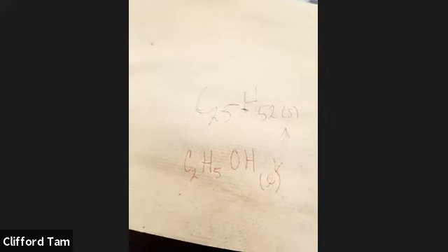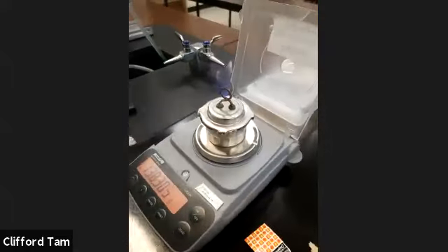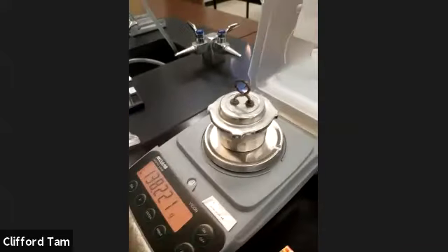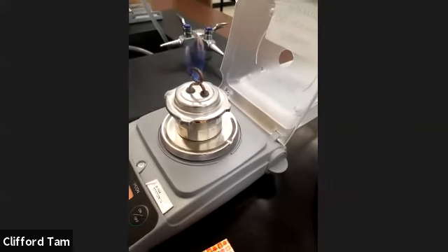And if you look at the molecular formula, that pretty much holds true to the number of bonds, if you're trying to compare the ratio of the two. Okay, so we're just going to keep on with this until a minute has passed. You guys notice right now only about 30 seconds has passed, and we've used up way more fuel in comparison to what we used before. So that's the idea behind the nature.